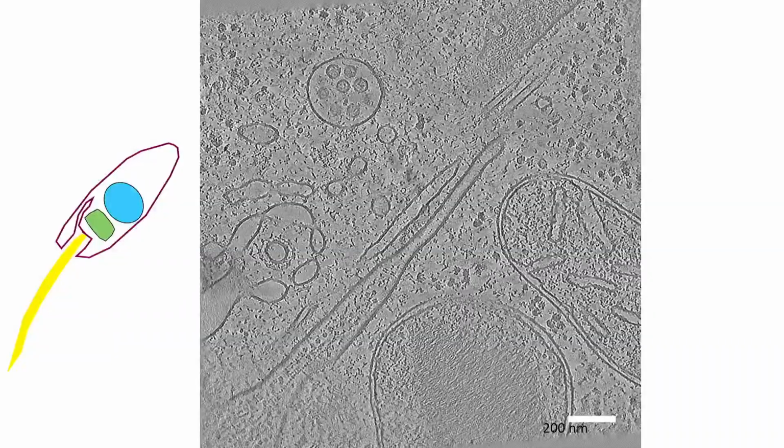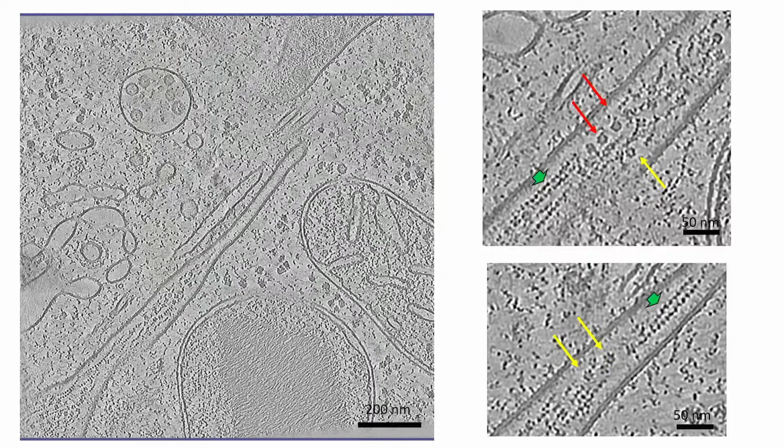And I tried to understand what these things inside the cytopharynx were. We have shapes like a square, and several small points, like a string of, how do I say that? Strings of bolinhas. Peas, exactly. We are trying to figure out what this is.